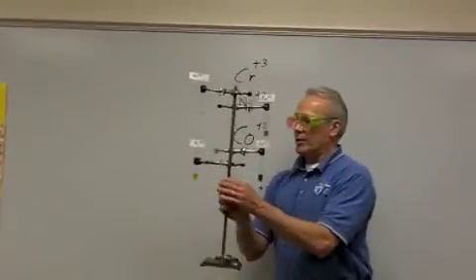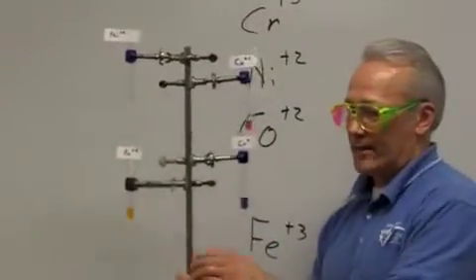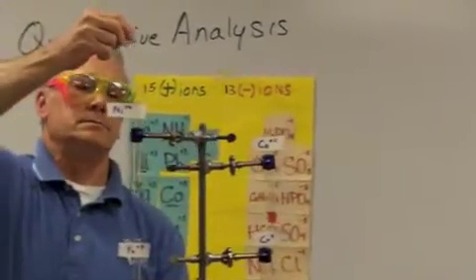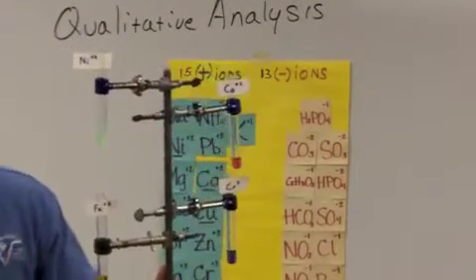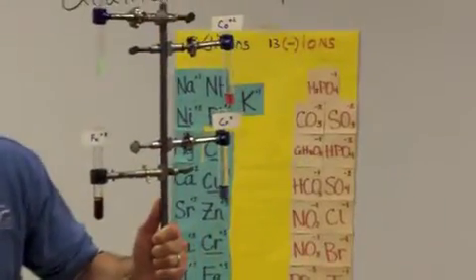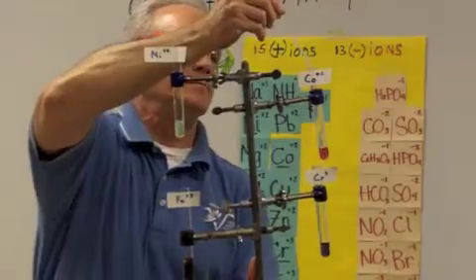What we'll do is add sodium hydroxide to each one to see if it reacts like our unknown did, because ours has to match one of these.